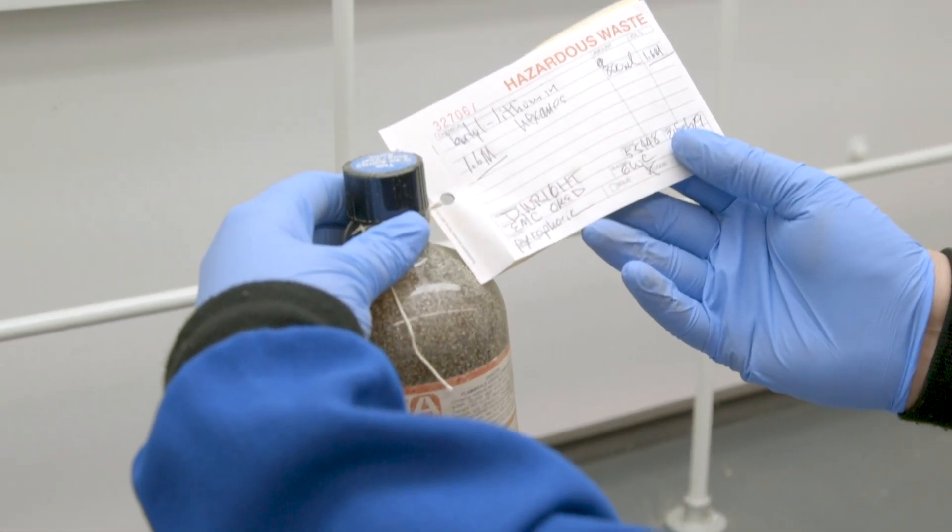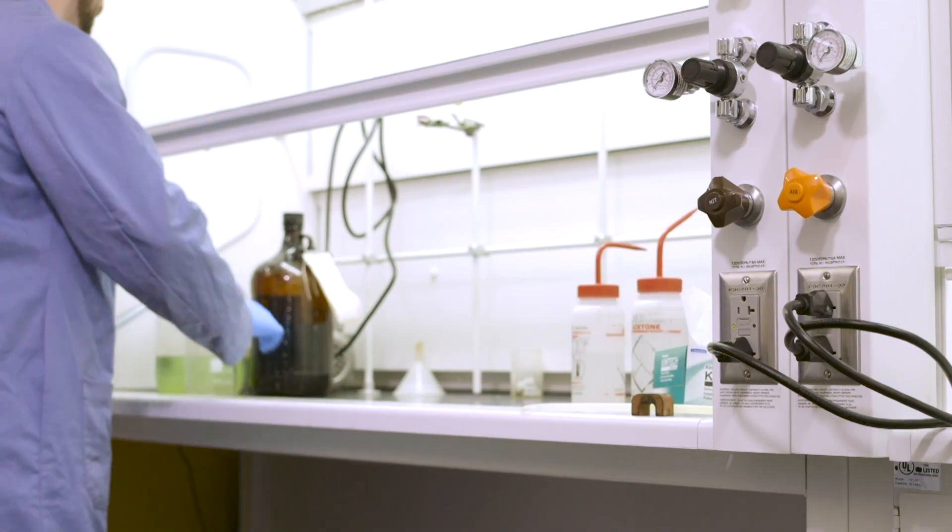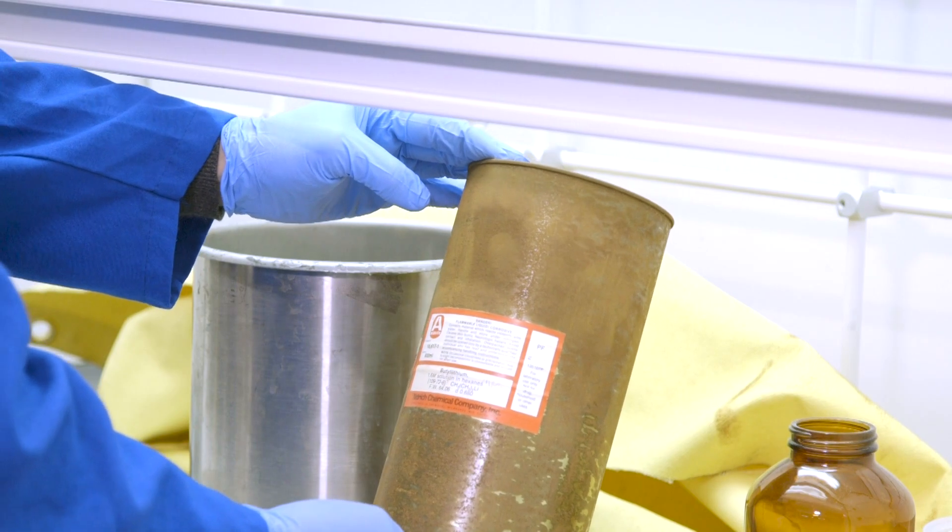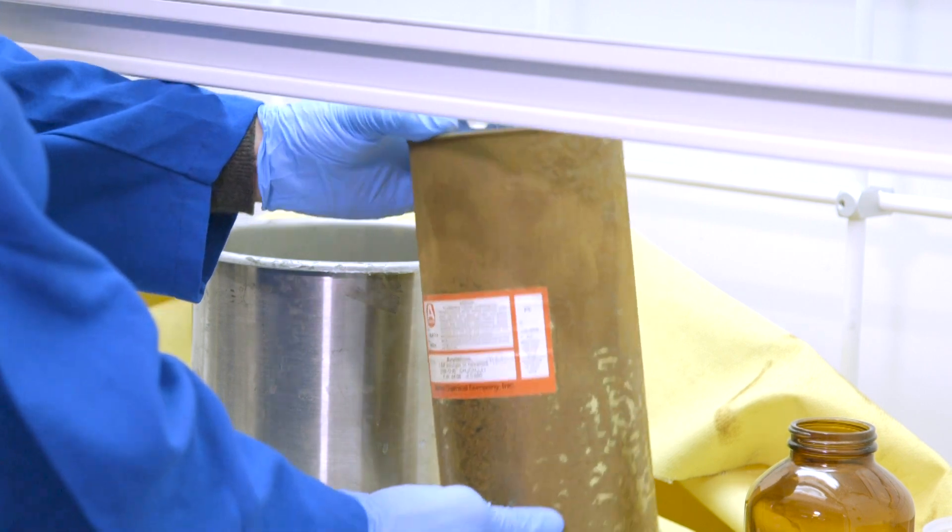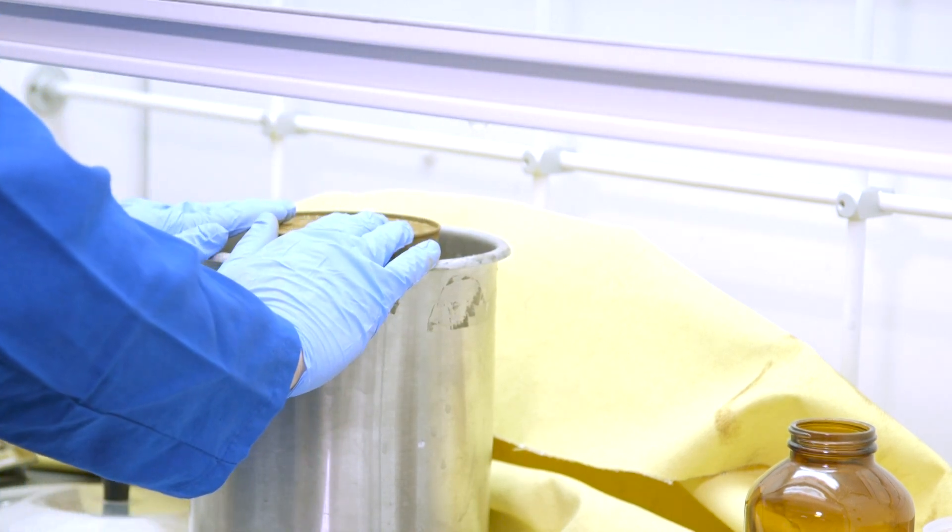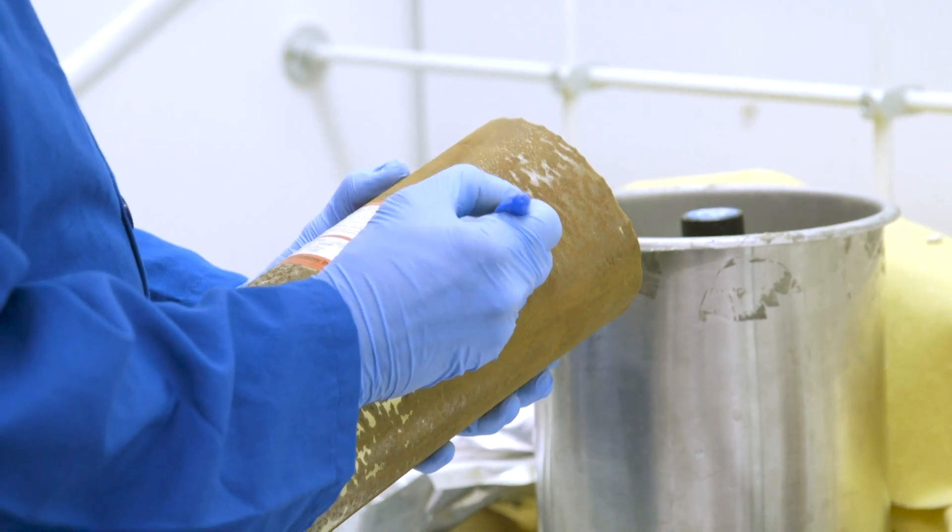Follow all procedures as provided in the ASU Hazardous Waste Management Training. For old or questionable containers, contact ASU-EHS for assistance. Ensure all pyrophoric materials and waste are properly stored. When not in use, pyrophoric reagent bottles are stored in flammable storage cabinets or flammable rated refrigerators. An inert gas filled desiccator or glove box are suitable locations for most pyrophoric materials. Pyrophoric materials must be kept closed and sealed with parafilm, tape, or another sealant during storage. Pyrophoric and other water reactive chemicals must be properly segregated from flammable materials by using secondary containment, which often consists of the original packaging can. This can should be saved and dated as to when it was first opened.